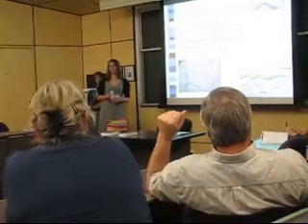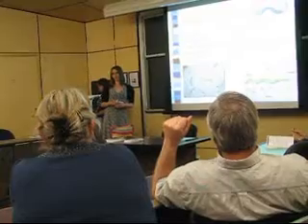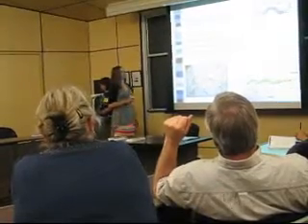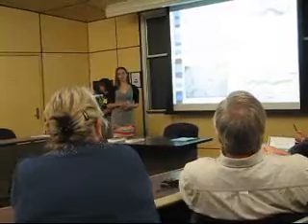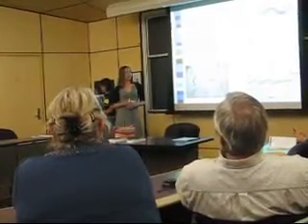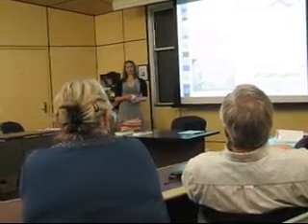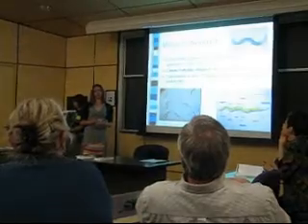They only have 1,000 cells and 300 neurons, so it makes for a very easily maintained organism to study in a lab setting. The main species of nematodes that we used in the lab this summer was Caenorhabditis elegans, and it's hermaphroditic, which is very useful in studying fertility and longevity at the same time because it can produce and fertilize its own eggs. It's also a good model organism because it has established studies in aging, longevity, development, and fertility.